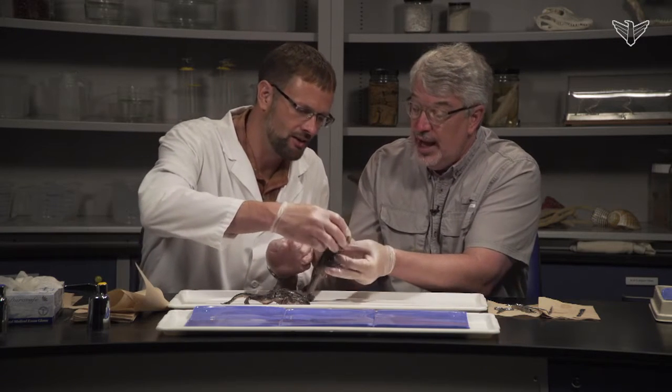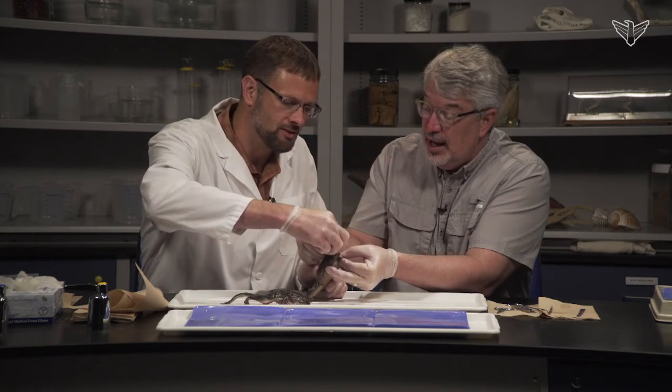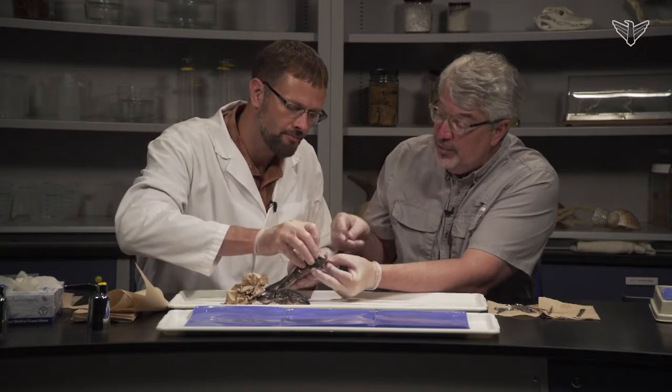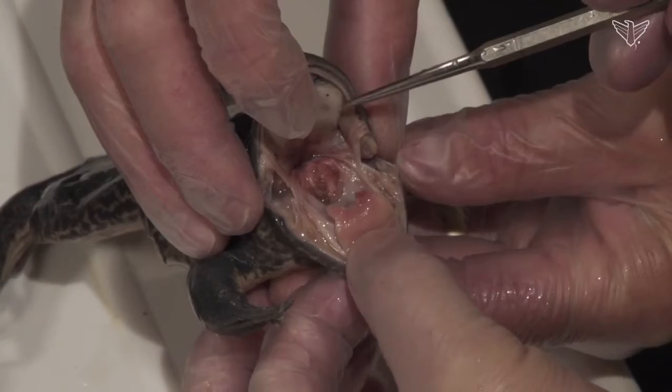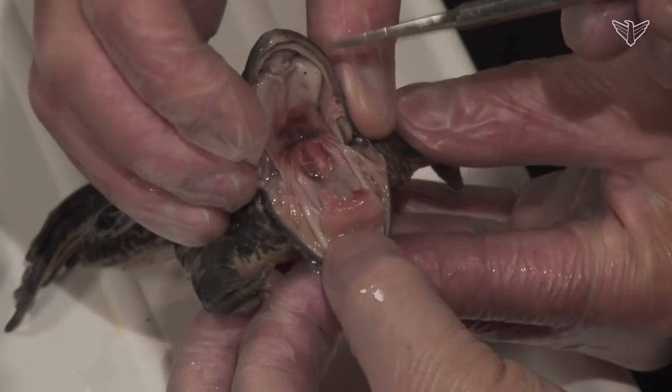You wanted to show something? So anyway, I'll pry it open a little bit for you. Can you hold him like that? So now he opens up quite a bit more, and you can see, first of all, if you want to move your finger just a little bit, there are two ridges of teeth here.